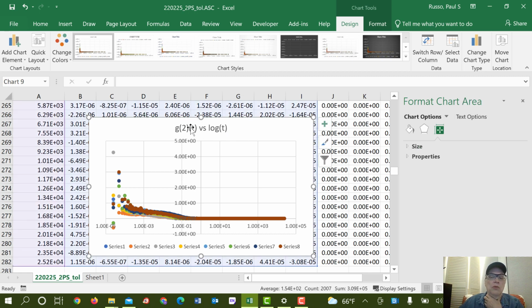And we know that for homodyne correlation functions that have Gaussian distribution of intensities, you can't exceed 1. And when it seems like you do exceed 1, that's some sort of instrumental problem. In this case, lots of correlated afterpulsing in some of the detectors. So let's try to eliminate that.